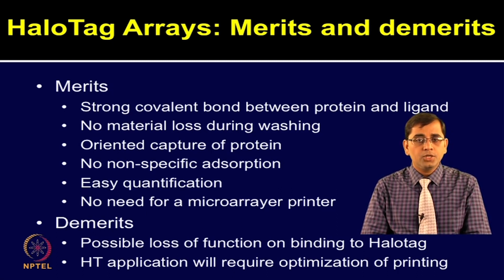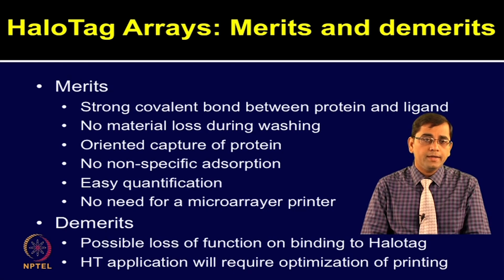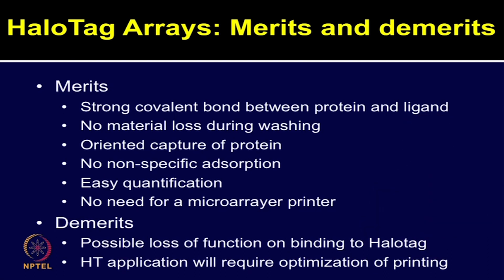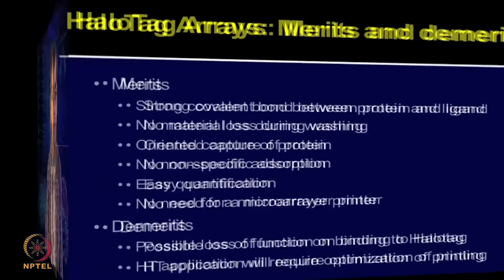However, there are certain limitations of using Halotag arrays. It has not been shown that the system can be used for high density arrays. Also, few spots using the commercial gaskets have been shown. So, applicability of this technology for high density protein microarrays is yet to be seen.